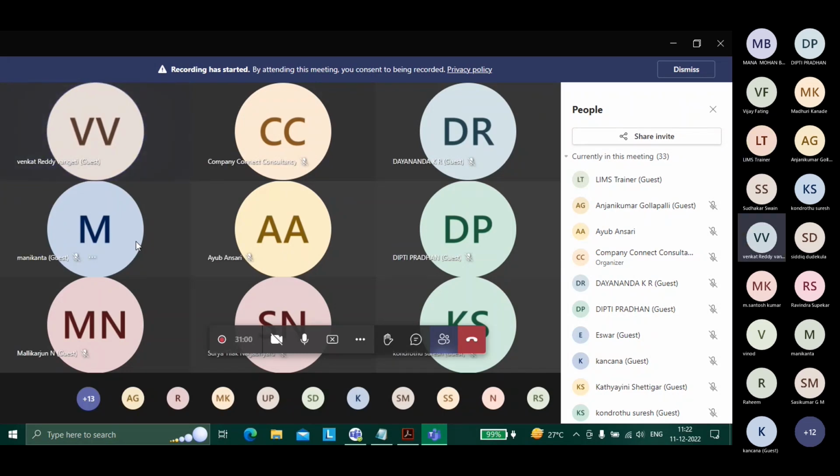See, each of the modules has its own function. If you want to do tests for environmental monitoring, you can go to the EM module. If you want to do stability testing, you need to go to the stability module. If you want to work on lots, you need to go to the lot manager and create lots. If you want to work with batches, you need to go to the batch manager. You understood, right? Yes, sir.